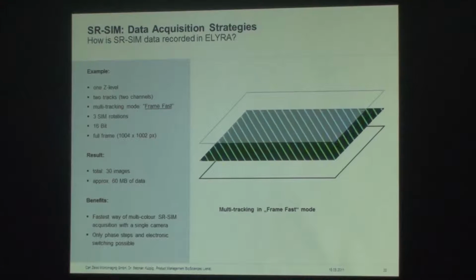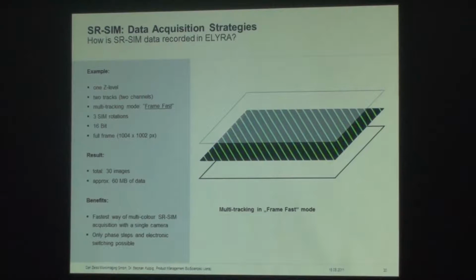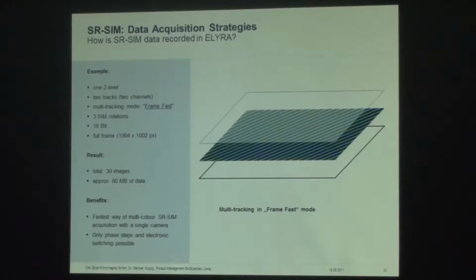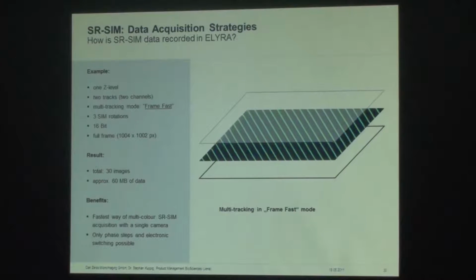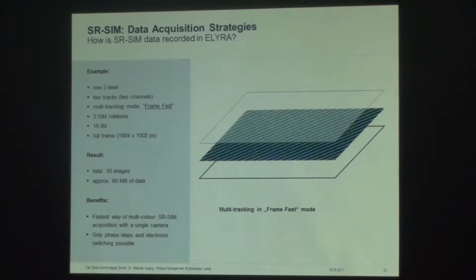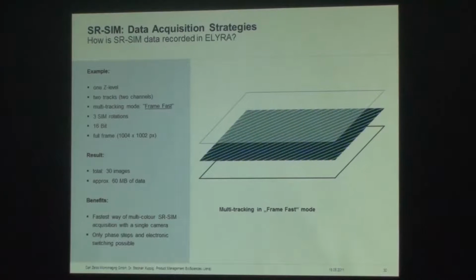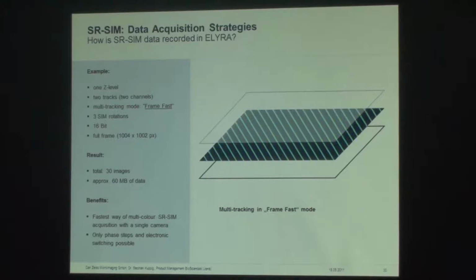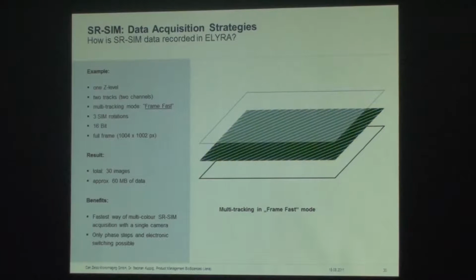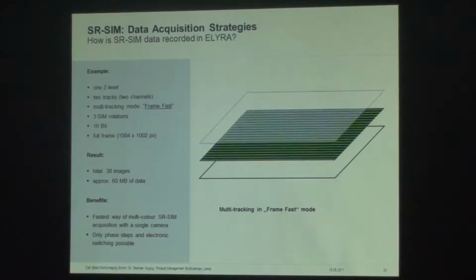Then if you wanted to do a time lapse, we did do some time lapse with live mitochondria, and it didn't disappoint. It was not bad. Actually, as Peter pointed out, the very important thing in live cell imaging microscopy is that you need to keep in mind your depth of focus. If your object is within the limit of the 63x planapo 1.4 NA objective, the drift of your objects beyond the depth of field will determine how successful your time lapse in super resolution will be.